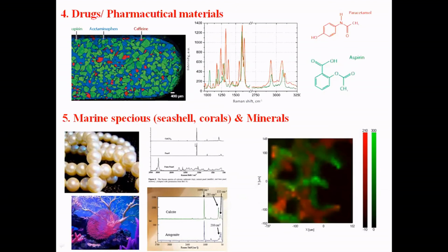If you get a calcium carbonate peak with less crystallinity, you come to know this is somewhat original. But if it is synthetic or a flux kind of thing, then you will get all the polymeric bands in the appearance. So this kind of analysis is highly useful. And of course, differentiating the seashells, I mean the marine species, is also possible; they are all made up of oxides and some mineral substances. That also can be easily differentiated. So which component is made up of which kind of substance.